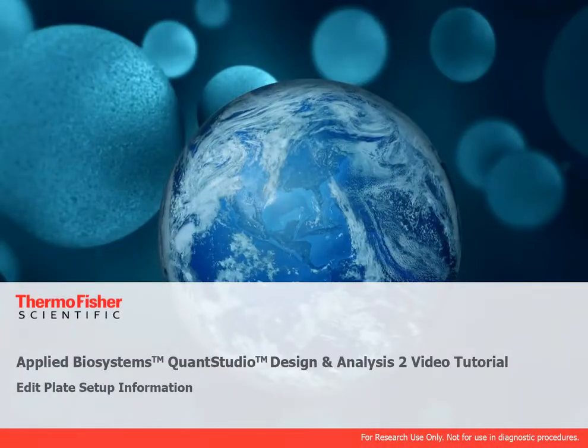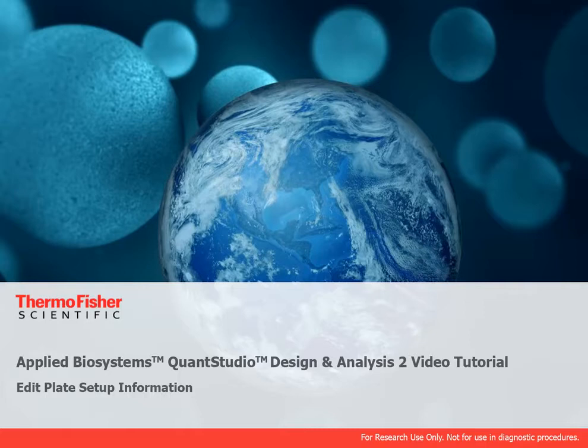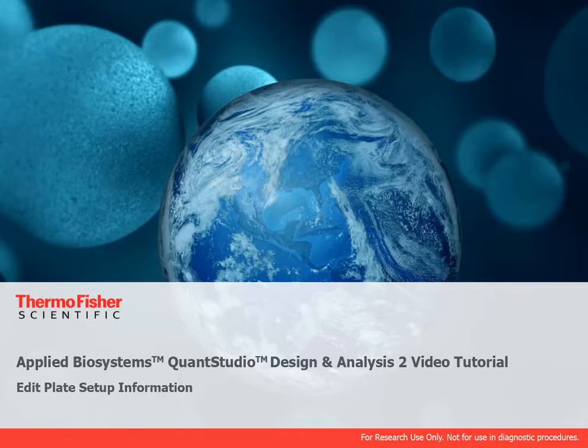Welcome to the video tutorial series for QuantStudio Design and Analysis 2. For this tutorial we'll be using the desktop version of the software, but you can also use the application on the Connect platform. In this video, we'll show you how to edit plate setup information.